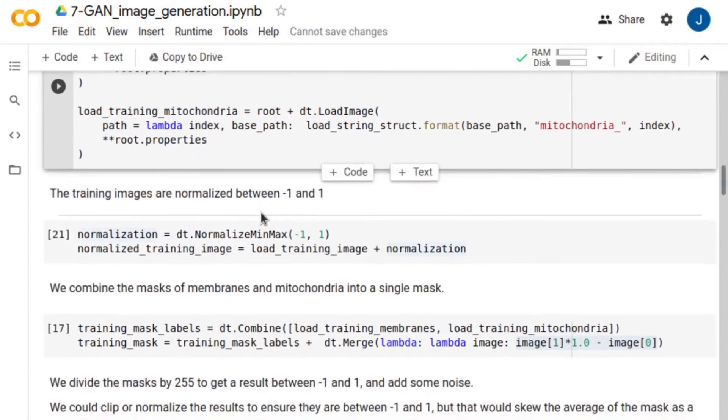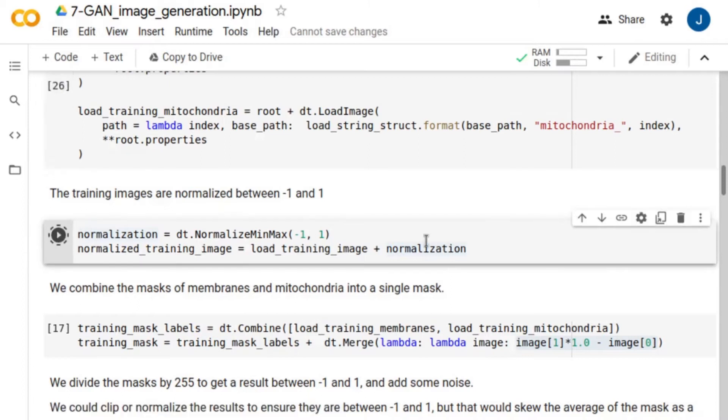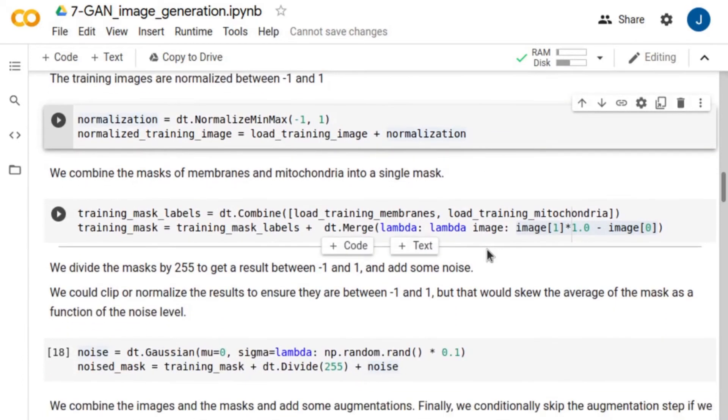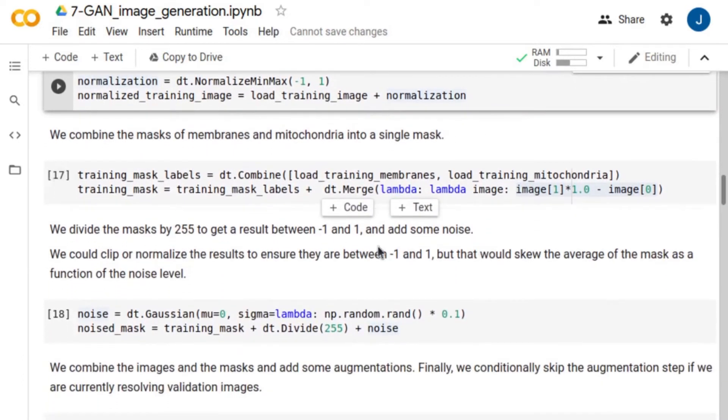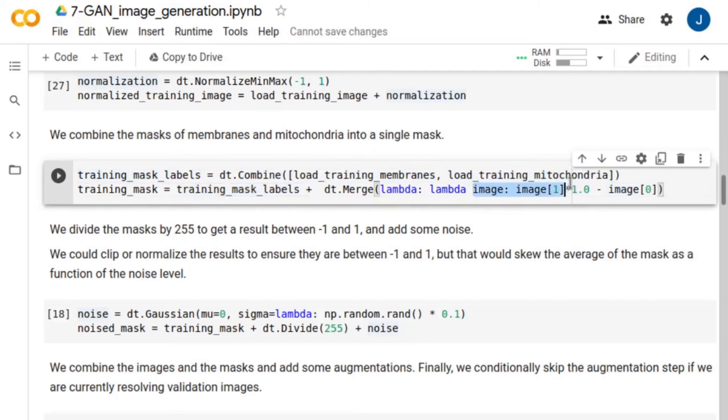One trick that is particularly useful in practice, especially when working with GANs, is normalizing the input as well as the output images between minus one and one. We normalize the cell images using the normalize min max feature. For the mask we combine the membranes and mitochondria images into a single segmentation. Then we normalize the results between minus one and one.